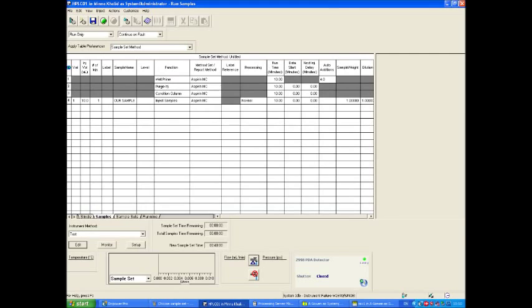Before running the samples, a number of steps must be carried out to prepare the HPLC instrument. This screen shows the startup procedure for the experiment. Direct function is selected and the following conditions are carried out. A function called wet prime is carried out for 10 minutes in order to pass the new solvent that will be used through the system. This helps ensure there is no residue from previous experiments remaining in the system.